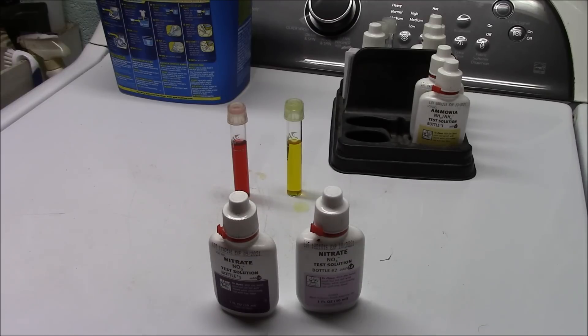I highly recommend getting a full test kit for your aquarium. You don't necessarily need to test all the time, but you should always have the ability to test your water if something's going on. If you have any questions, go right to your test kit and find out the basics: what's the pH, do I have any ammonia, do I have any nitrite buildup, what are my nitrates — and you can go from there. In the near future we'll talk more about my approach to water testing, when I test and what I test for.